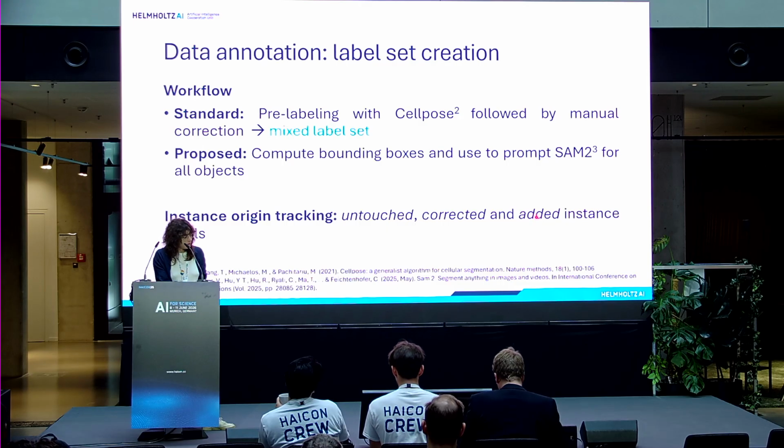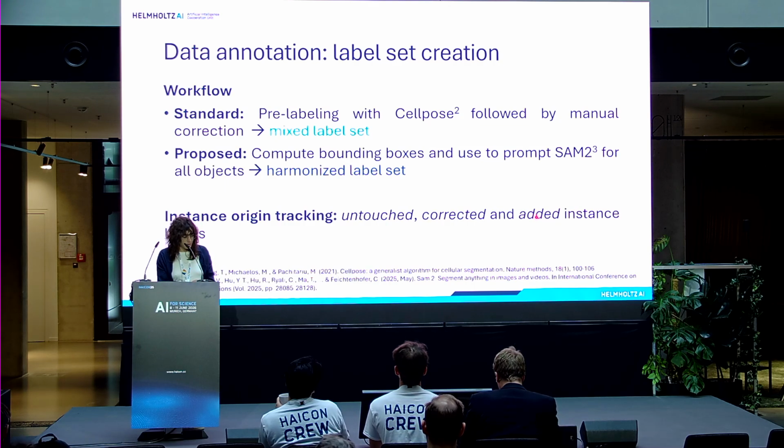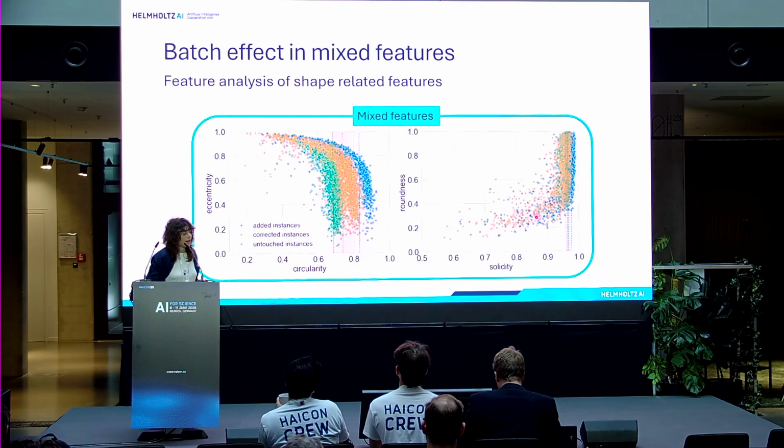And from our standard workflow, we get our mixed label set, whereas from the proposed workflow, we get our harmonized label set, where all outputs come from the same source. And as I mentioned, having a curated data set allows us to do further downstream tasks.